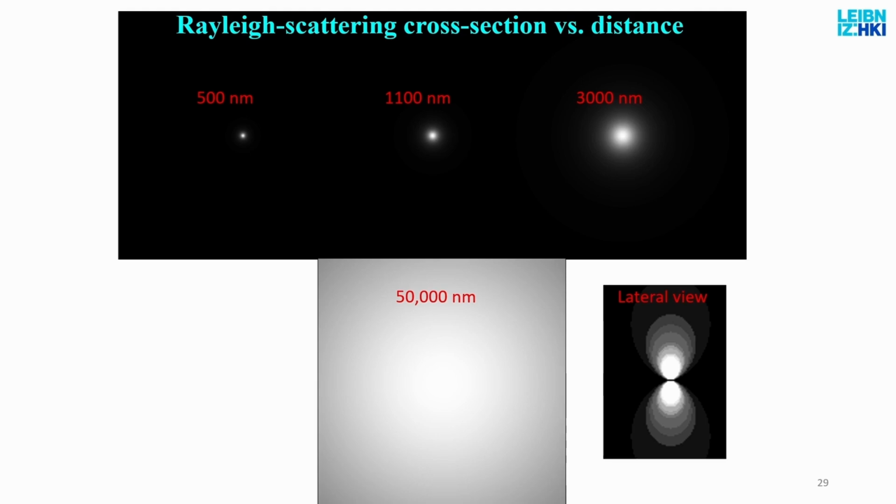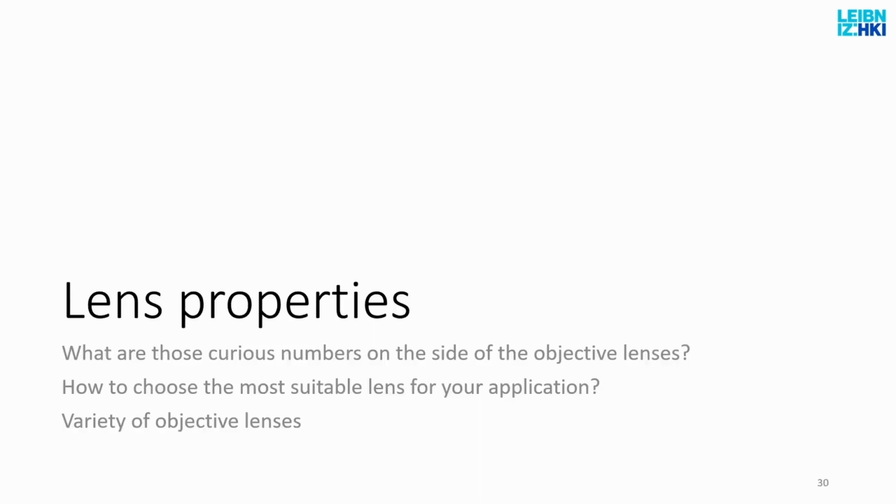So by the time you look through a cell, which is let's say 5 to 10 microns thick, the molecule that is point-like will cause so much scattering that you will have no idea how big that molecule was. So besides resolution limits, scattering itself will cause you enough problems not to be able to resolve such small objects. And if you are 50 microns away, then you can forget it. There is no information left at all about the object.